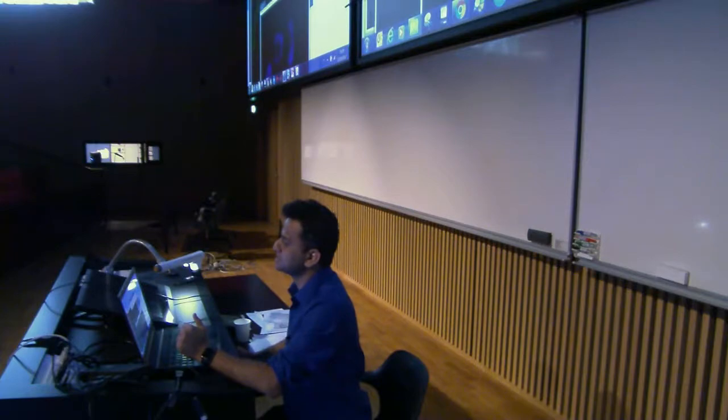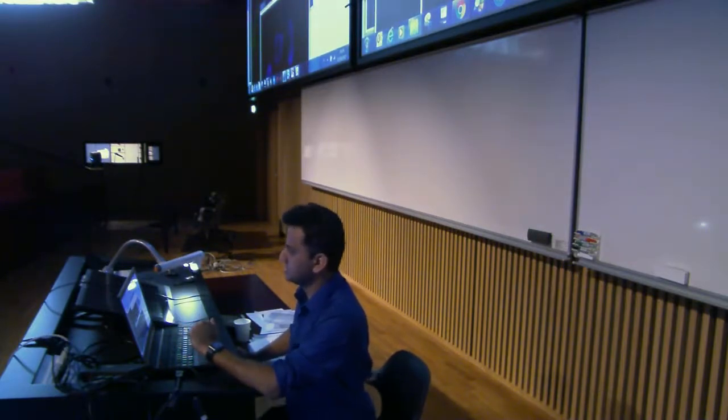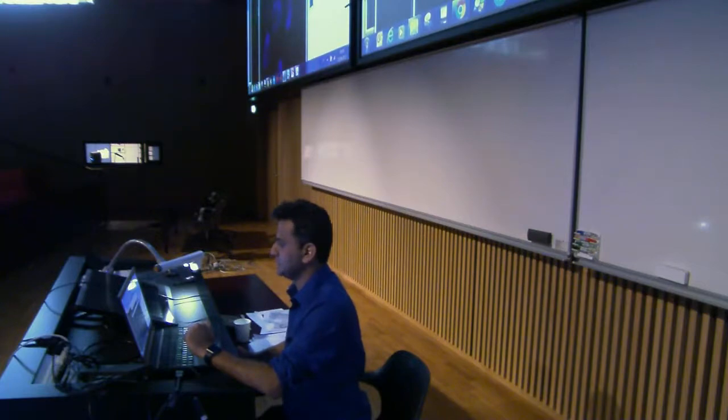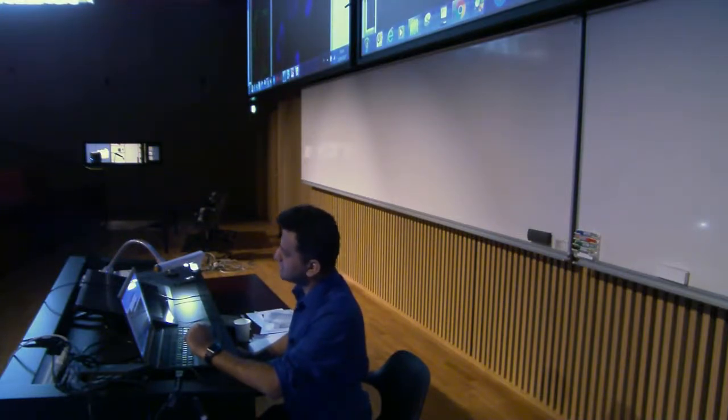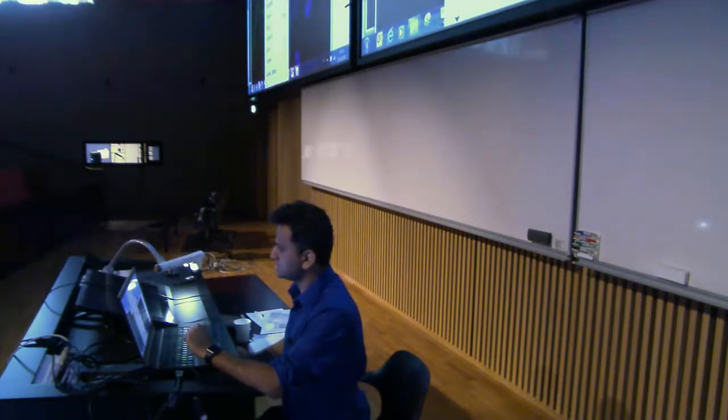So it's always a good idea to check whether there is a micrometer, or whatever scale you have acquired, available instead of pixels. This is how you should check and ensure. So how to set a scale bar? First, in order to set a scale bar, we have to tell ImageJ what your physical pixel dimension is. In order to check what pixel dimension it has, go to Image, say Properties.